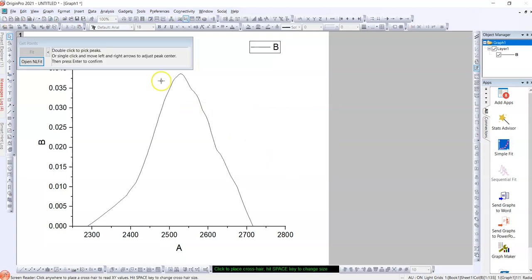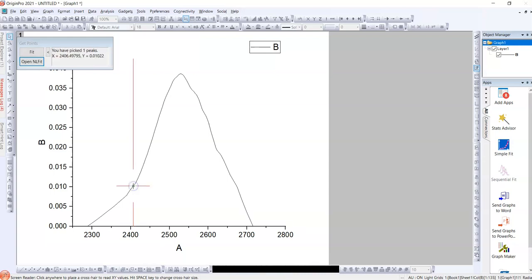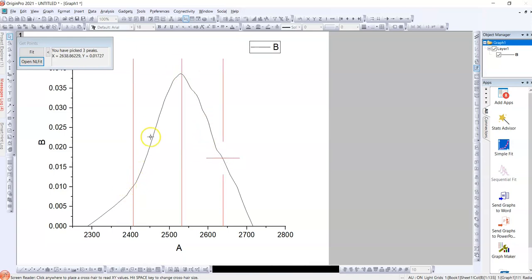A tabular table or box has already been opened. I assume that three peaks are there. For the new learner, it is imperative that we will not have to show the exact peak position. By the iteration tactic, we will have the exact peak position which I will show later. So one peak here, one peak here, I assume another peak here. I just now click open NL fit.